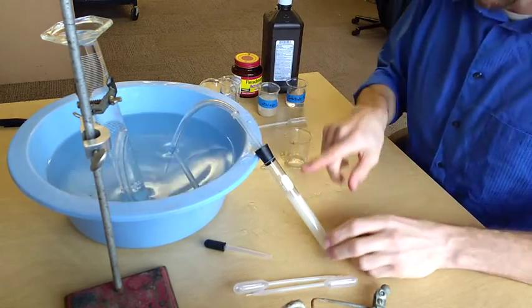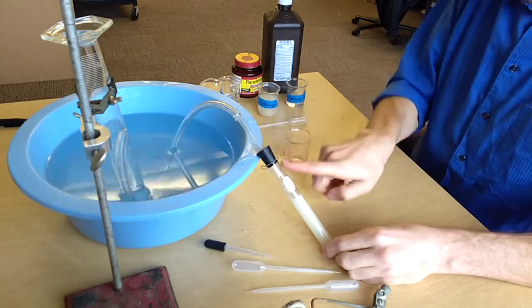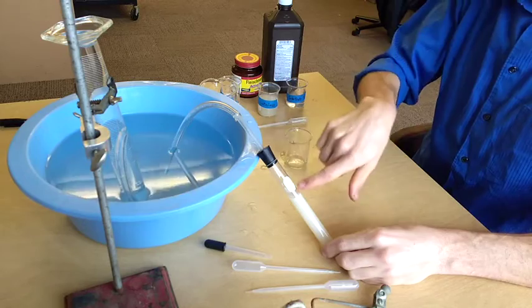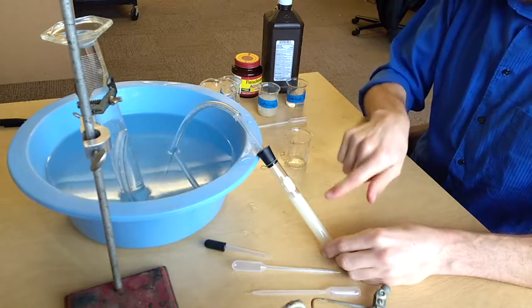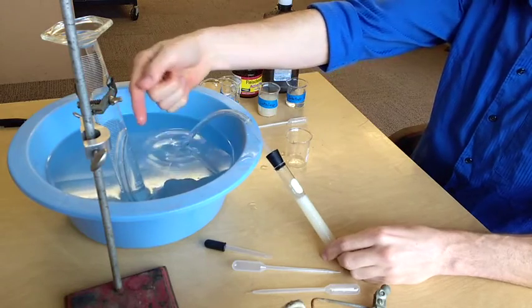Now it's very important that you keep your test tube pointed up, so any gas that gets formed actually goes out the tube. If you flip this over, it'll push the yeast liquid up through the tube, which will go through the container.